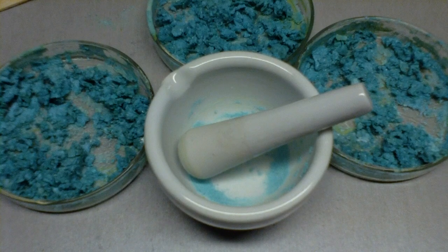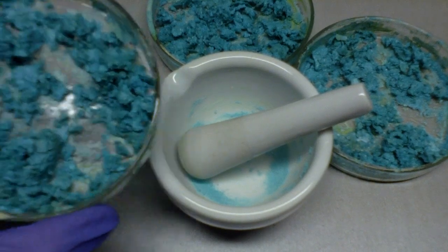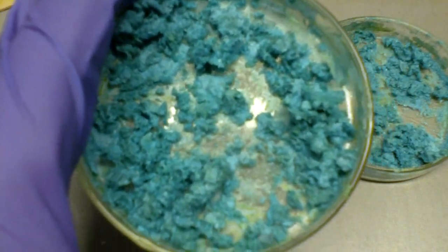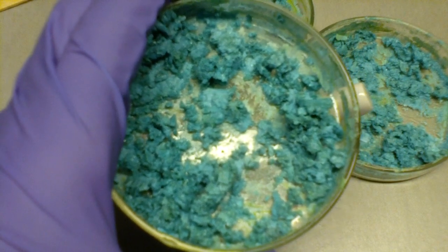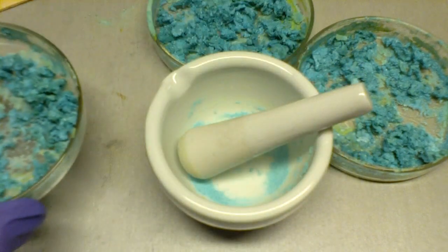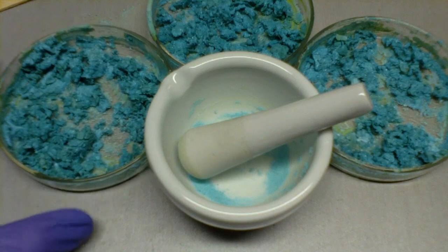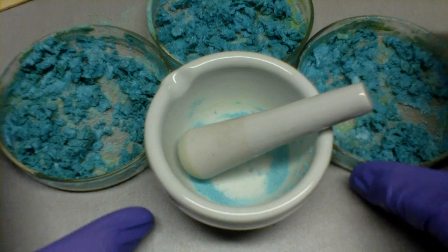This is the copper chloride after drying for 1 week. As you can see, it has turned into a blue crystalline solid, which is how it should look. This is copper chloride dihydrate, which is copper chloride with 2 water molecules in the crystals. If you want anhydrous copper chloride, you can just take the blue powder and heat it up until it goes brown. That will be anhydrous copper chloride.